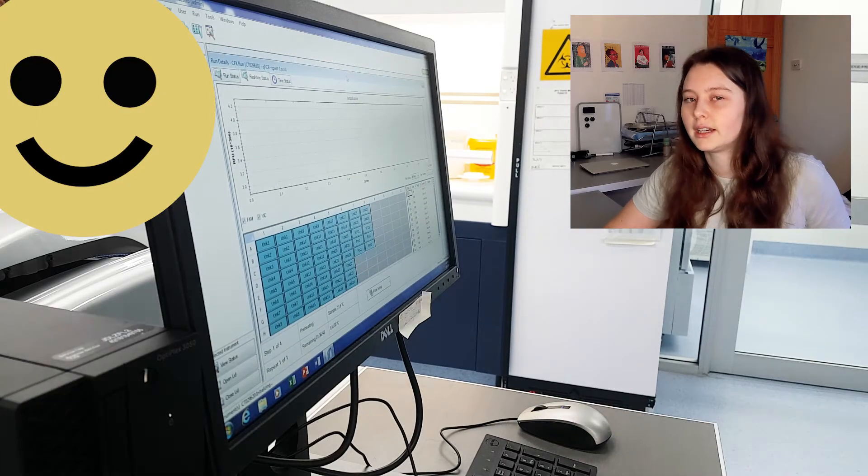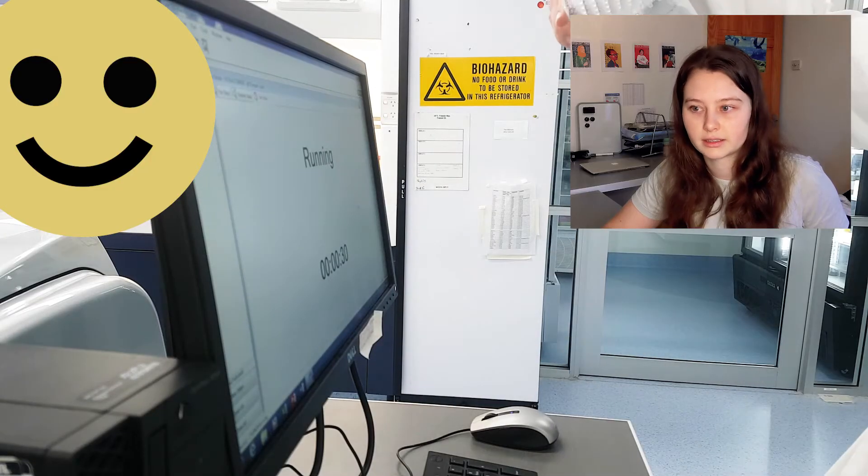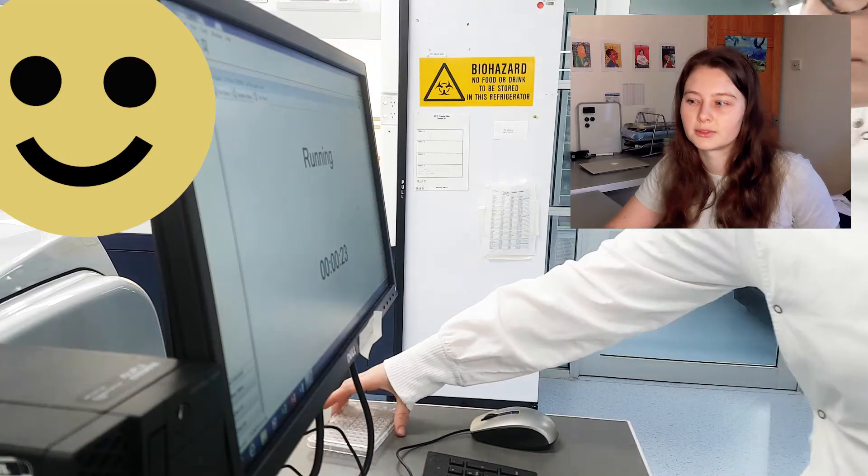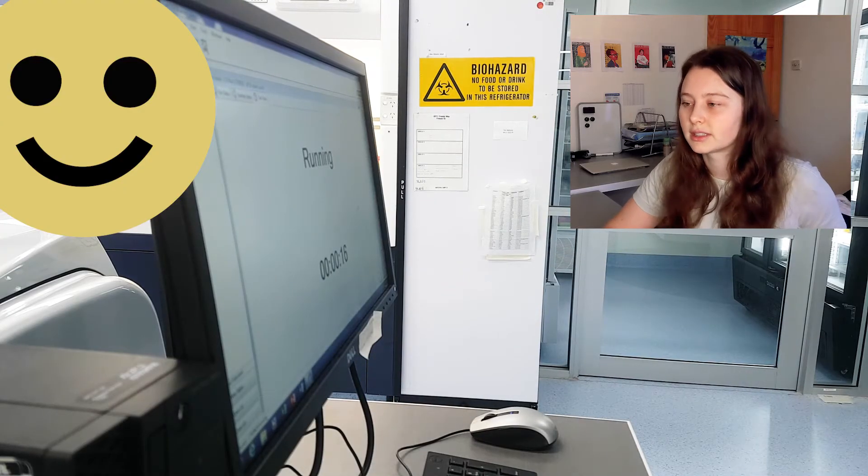My qPCR takes about one hour thirty-eight minutes, or at least that's what it tells me. I think it takes more like one hour forty-two. It's always a little inaccurate.